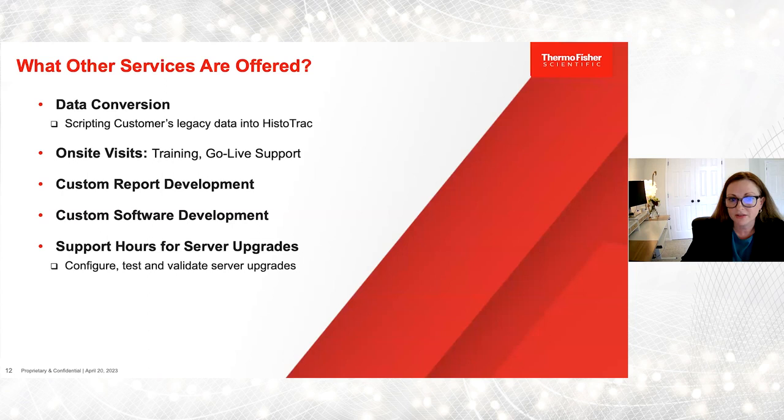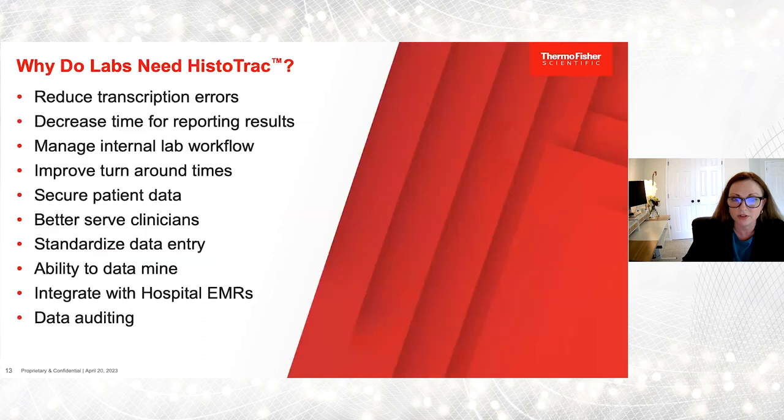We do offer various other services. They were discussed a little bit earlier in the PowerPoint. Data conversion: if you needed us to take your legacy data and get it converted into HistoTrac, so you have a one-stop database, we could do that. We do on-site training visits, report development, and, since everybody's switching servers right now, we offer hours for supporting your server upgrades.